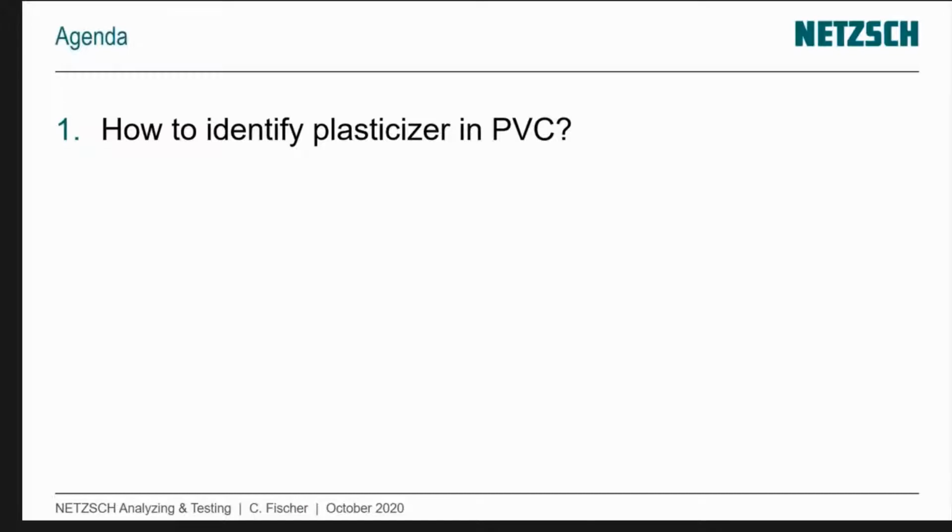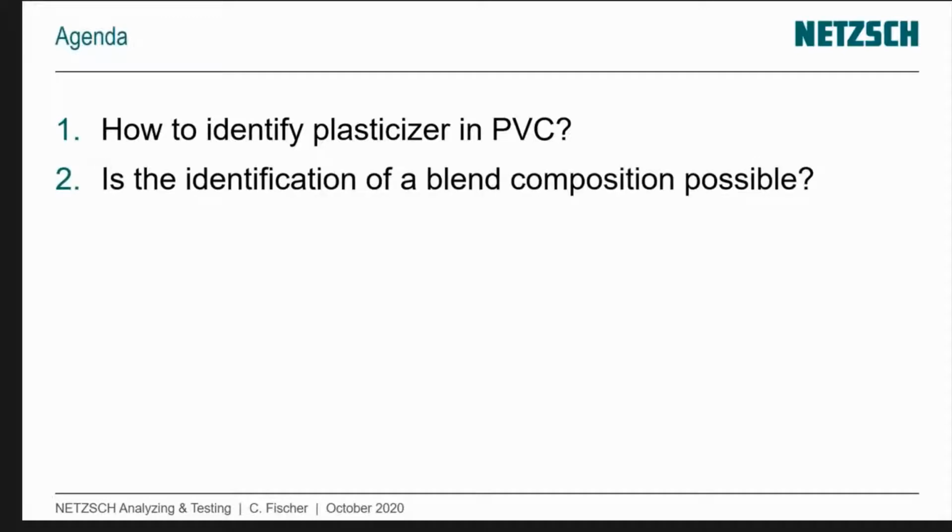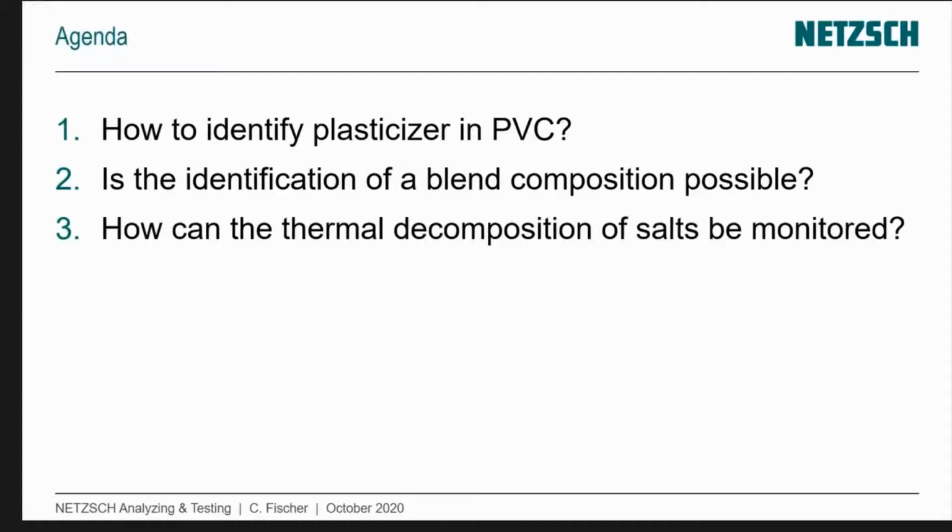Question number 1: How to identify plasticizer in PVC? Question 2: Is the identification of a blend composition possible? Question 3: How can the thermal decomposition of salts be monitored?